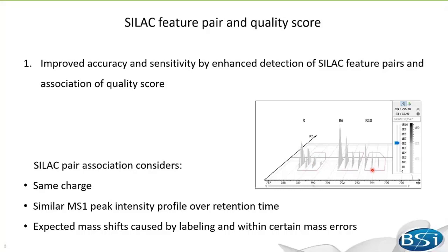These three individual features are associated as a SILAC pair based on: first, they are of the same charge, which we can tell from the isotopic distribution; secondly, whether these feature peaks share a similar MS-1 peak intensity profile over the retention time; and lastly, if they fall within expected mass shifts due to labeling and are within certain mass errors.